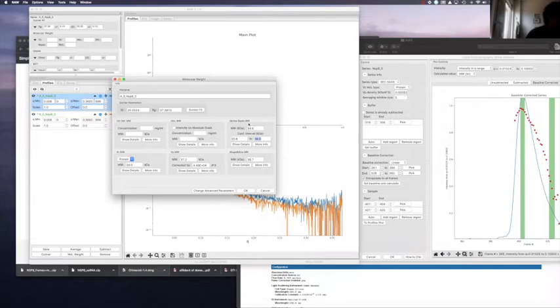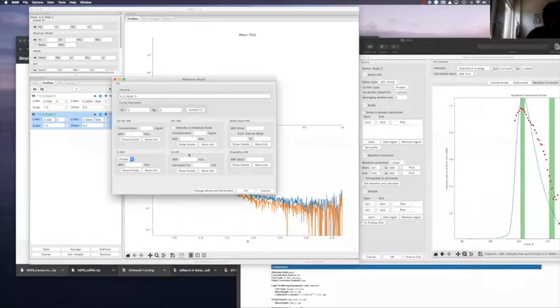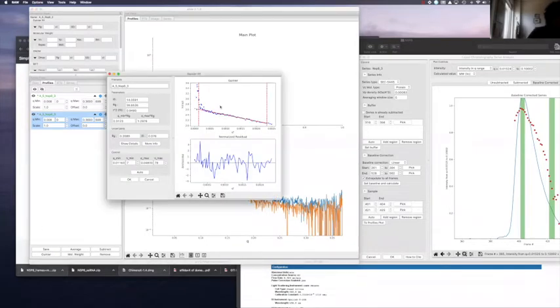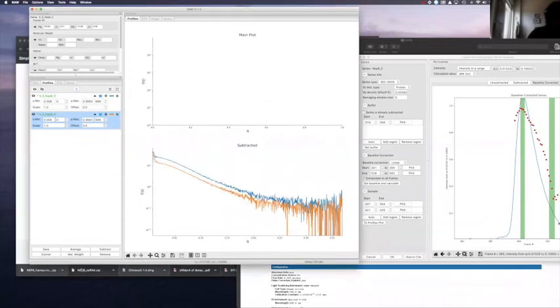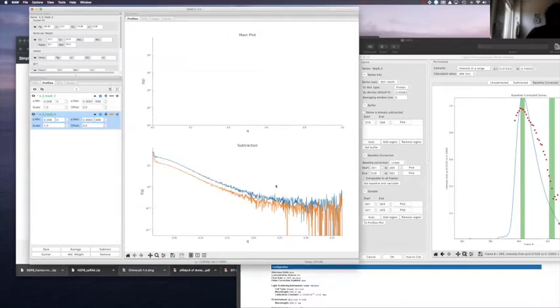34.6 is based on Bayesian, and then there are the different calculators here as well, like for the correlation and for volume, or based on shape and size. When you do the same molecular weight calculations for other sides of the peak, okay, I forgot to calculate the Guinier. You can't forget to calculate the Guinier for it, and you need to click on OK. And you see the molecular weight drops a little bit, instead of 34 and 33, but it's still pretty high.